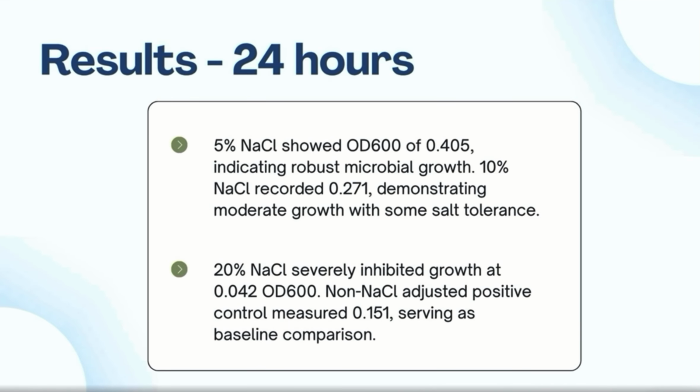The data collected after the first 24 hours of incubation was measured via spectrophotometric analysis at 600 nanometers. The 5% sodium chloride environment demonstrated robust microbial growth, reaching an OD 600 of 0.405. At 10% sodium chloride, we observed moderate growth with an absorbance reading of 0.271, showing that the bacteria possess some initial salt tolerance.